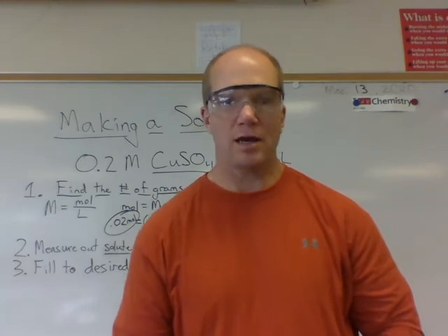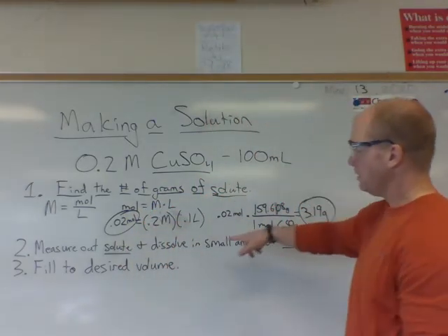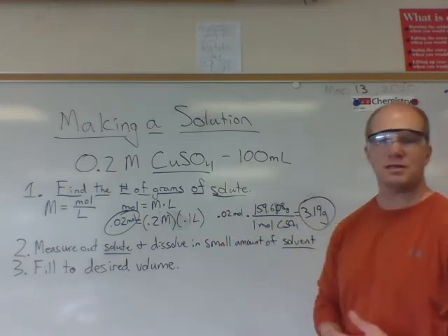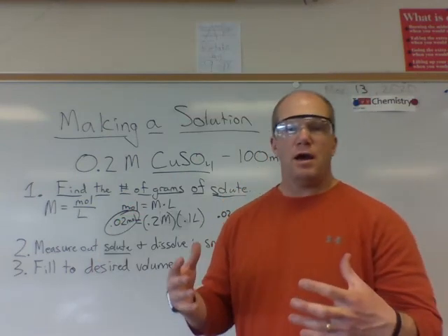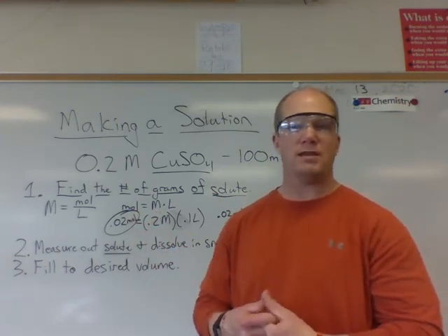So that's how you make a molar solution, you guys. You find the grams of solute, you measure it out and dissolve it in a small amount of water, and then you fill it to the desired volume. So what I want you to do is this, you guys. I'm going to give you a problem on an assignment, and you're going to do the calculation and tell me how you would make that solution.